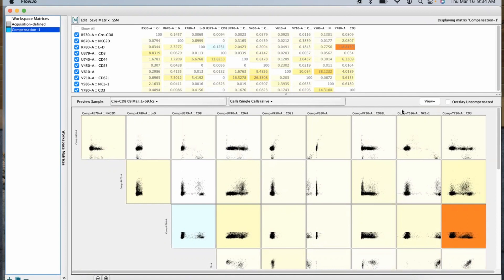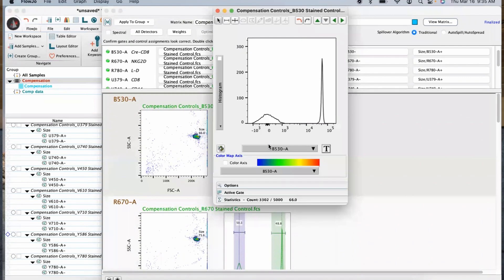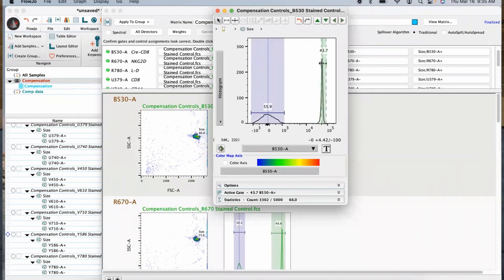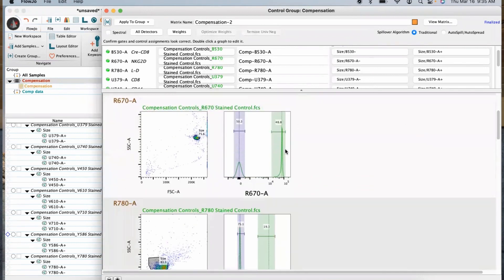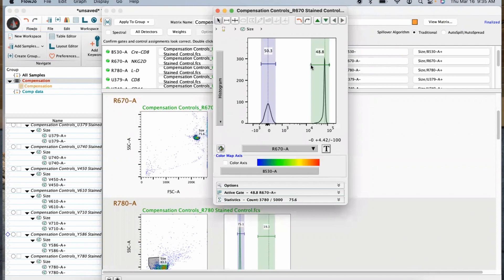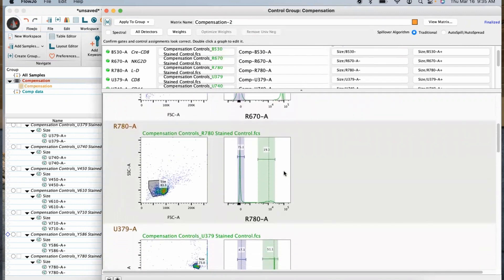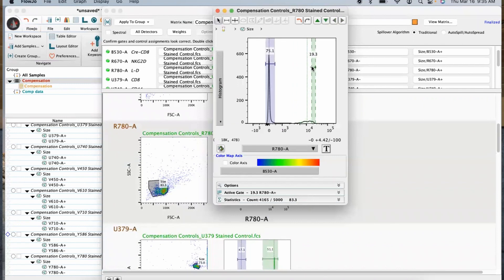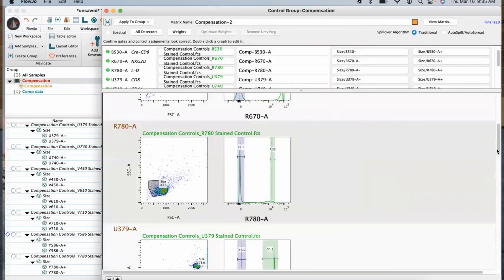Now if you've done this in FlowJo and it still doesn't look quite right, another trick you can use is to go in and adjust your gates so that you're only gating on the brightest part of that population. Since compensation is a calculation of the mean or the median, if you only grab the highest part of your histograms, you're going to increase that median and sometimes that will give you a slightly better compensation result. When you're doing this, make sure you're grabbing enough events in the gate that you can still calculate it — you don't want to bring it so far over to the edge that there's nothing in there. Thankfully, FlowJo will usually flag that for you if you go too low.